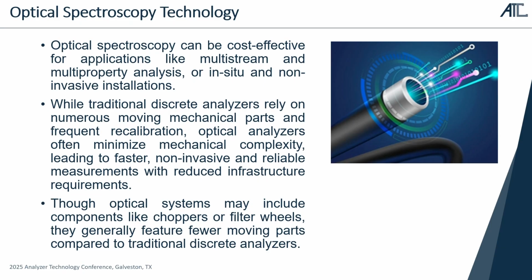And the analyzers we are talking about included a special condenser, which was used to maintain a constant temperature of the sulfur. In fact, we were trying to establish equilibrium with a constant sulfur vapors content, which can be compensated. It's very complicated to build such a system. Such a system requires very serious and extensive maintenance.